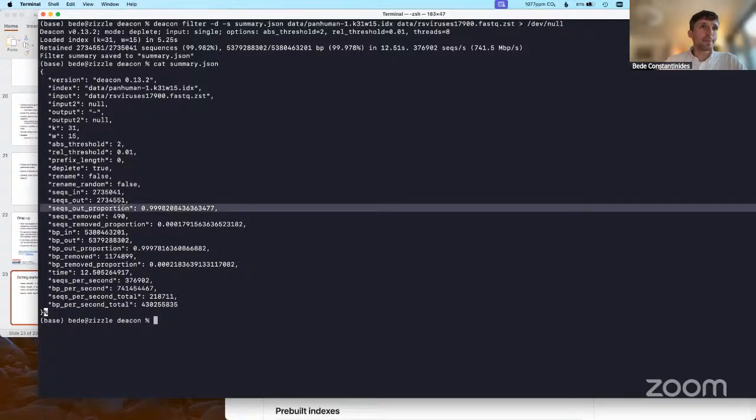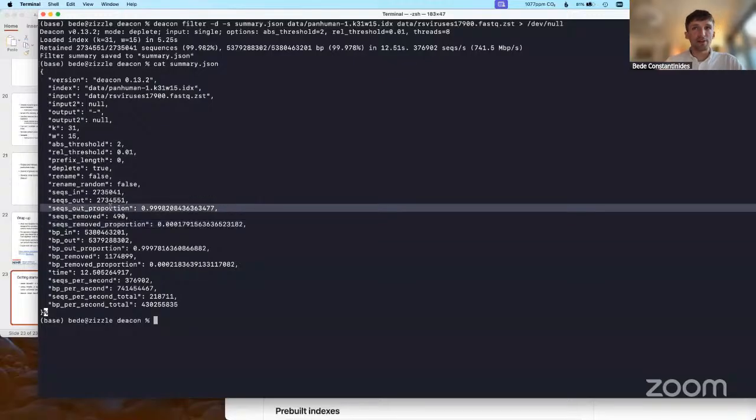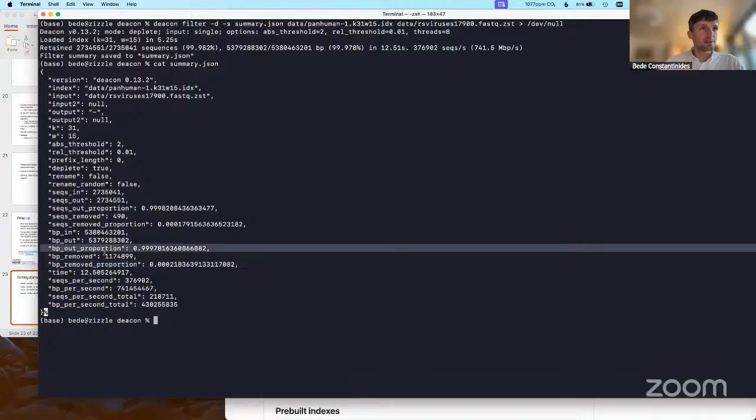So we can see exactly what it's done here. I find so often we talk about host depletion in terms of reads removed, but when you have ONT reads, they vary in length, so it's quite useful to know the actual bases removed. We've got lots of information here: the parameters that we ran with, our absolute and relative thresholds, which are really important parameters, and what proportion of our input records passed the filter and what proportion of bases passed the filter.